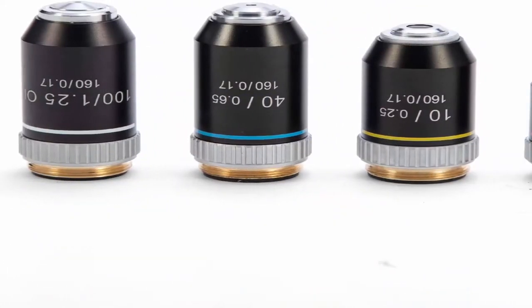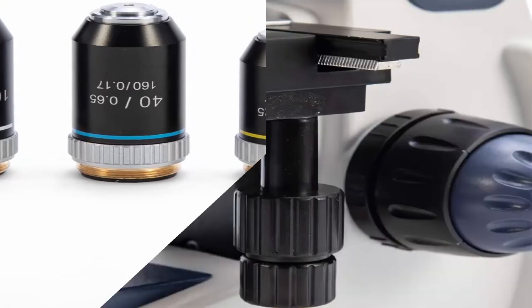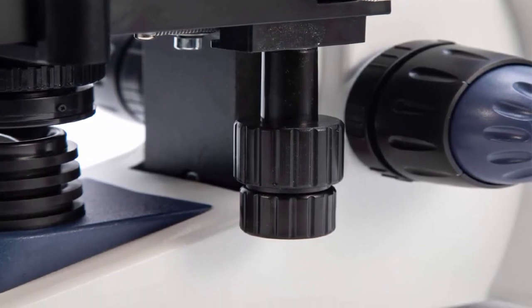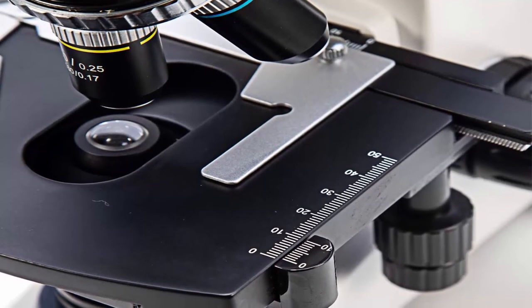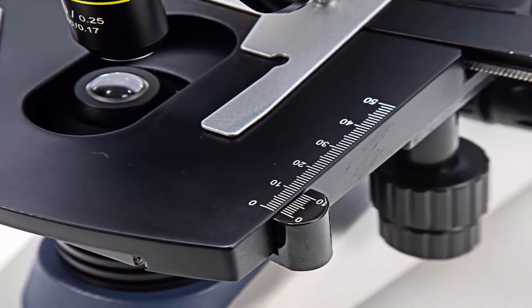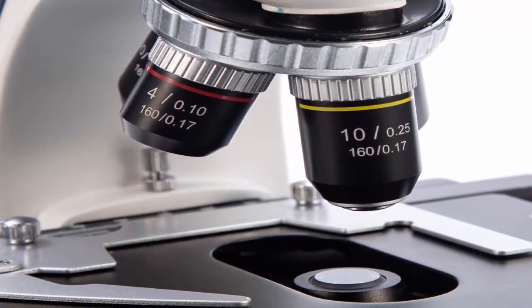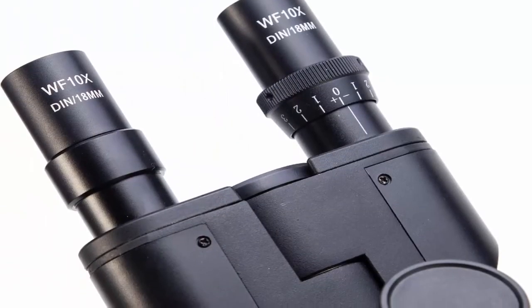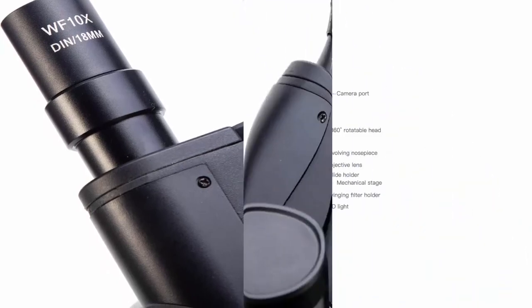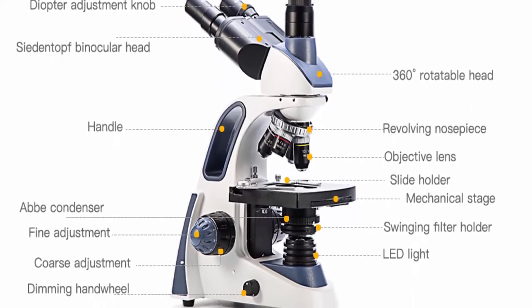The professional seidentopf trinocular head is fully rotatable for shared use and equipped with interchangeable wide-field 10x and 25x glass eyepieces fixed at an ergonomic 30-degree tilt to reduce neck strain, and is easily adjustable for different interpupillary distances without losing focus. Four DIN achromatic objectives mounted in a revolving turret offer six magnification levels: 40x, 100x, 250x, 400x, 1000x, and 2500x. Ultra-precise focusing system for coarse and extremely fine adjustments. Trinocular head accepts an additional eyepiece and microscope camera attachments to view, livestream, record, and capture magnified specimen images.